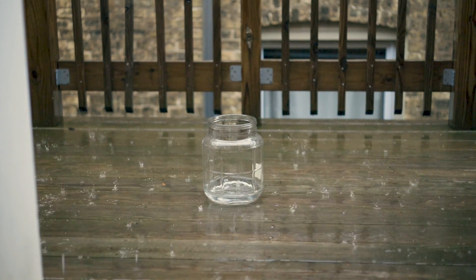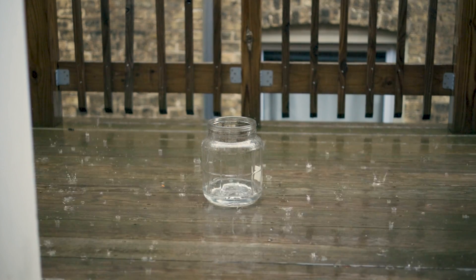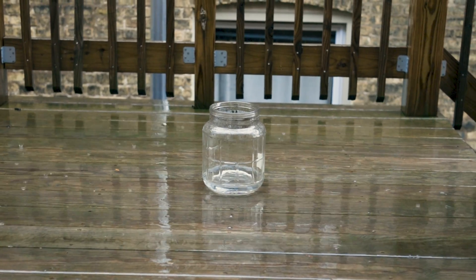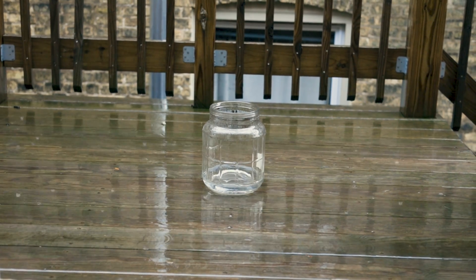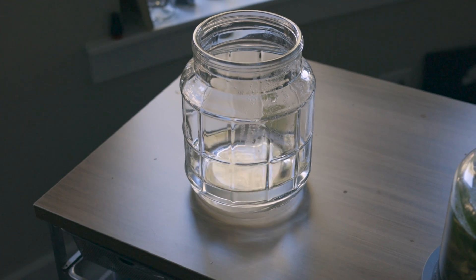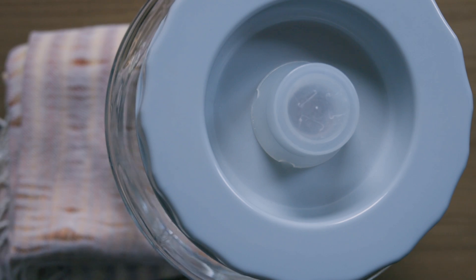It is raining — that's exactly what I was waiting for. There is not much water collected in the jar, but it has to do it. This water is desperately needed. Before I use the rain water, I would like to see what's in it.